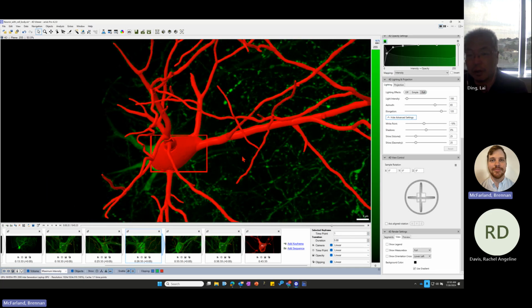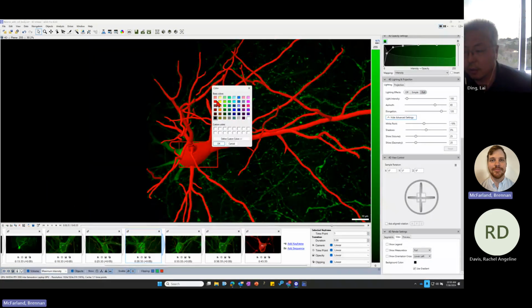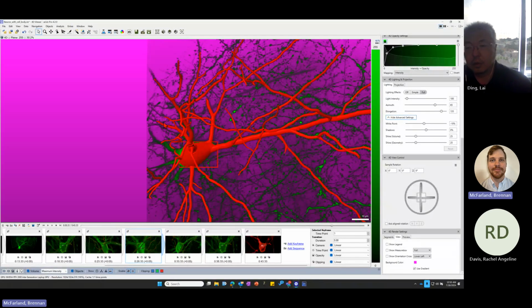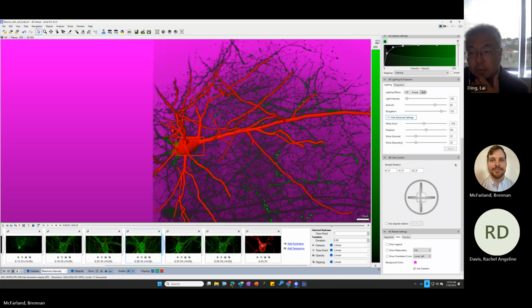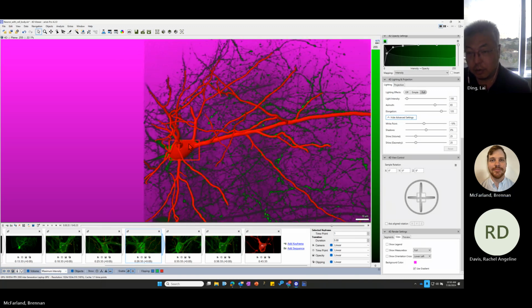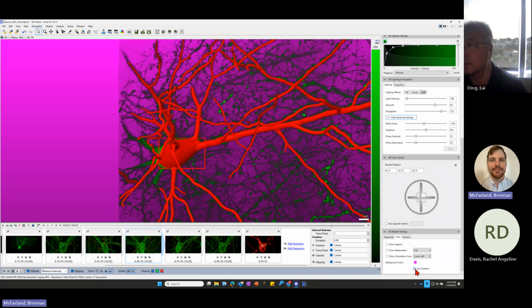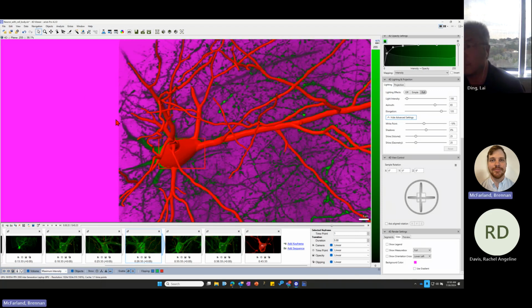I have not selected this gradient, so I'm curious what this will do. I'll do something like maybe magenta. Will this give me, oh yeah. You can kind of see it's brighter in some regions. Looks like it's darker magenta down here, lighter, brighter magenta up here. Gradient. Now you can see it's just one single color. We'll put this back to black.